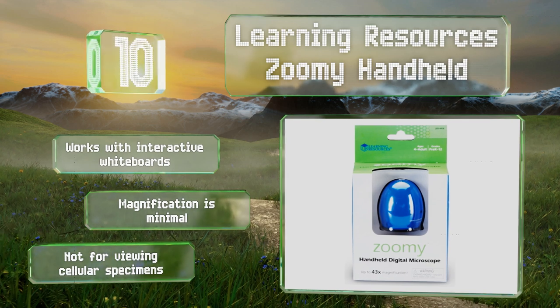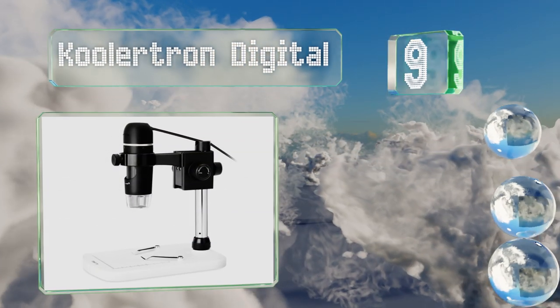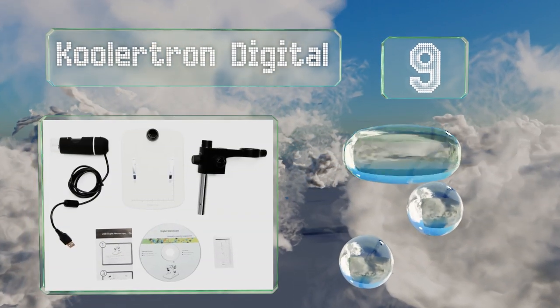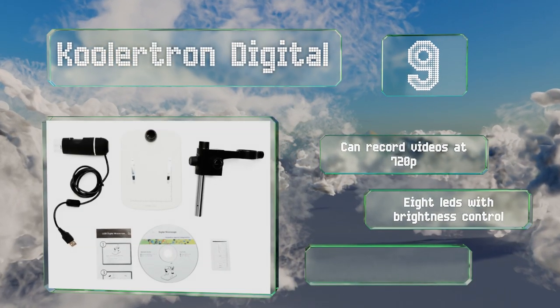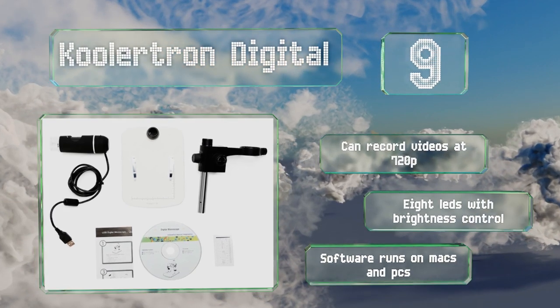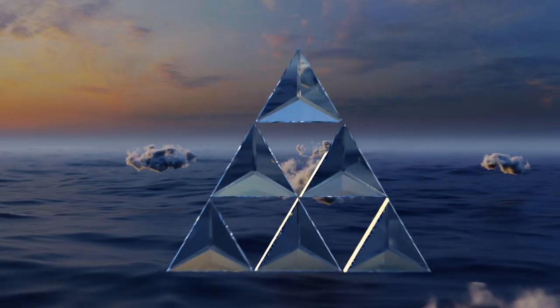At number nine, the Coolatron Digital is a fine option considering its low price point. It's a little stiff for making precise adjustments, but otherwise it's of impressively high quality, capturing high resolution images at up to 300 times magnification. It can record videos at 720p and includes eight LEDs with brightness control. Its software runs on Macs and PCs.